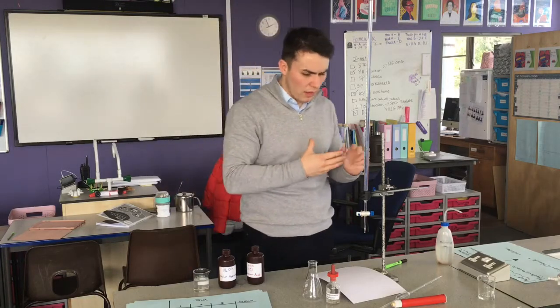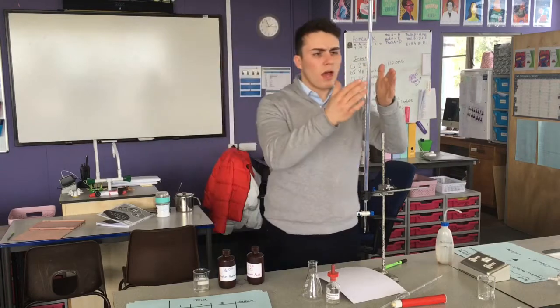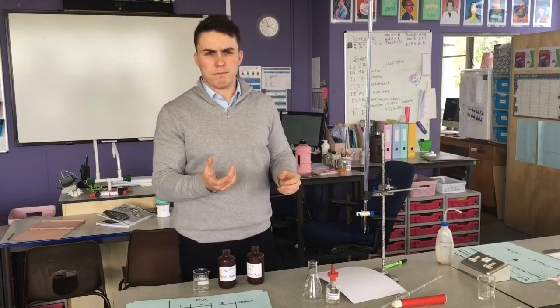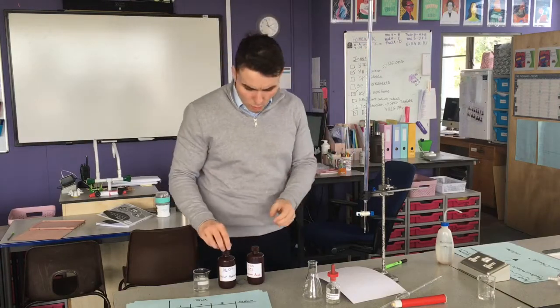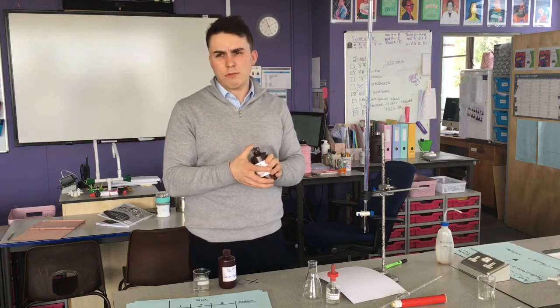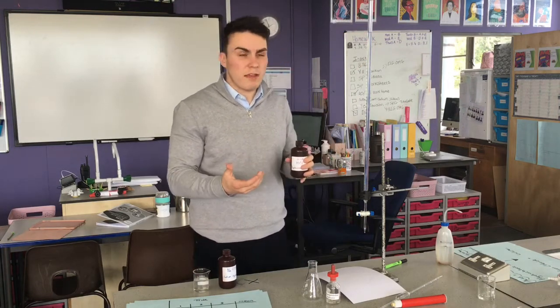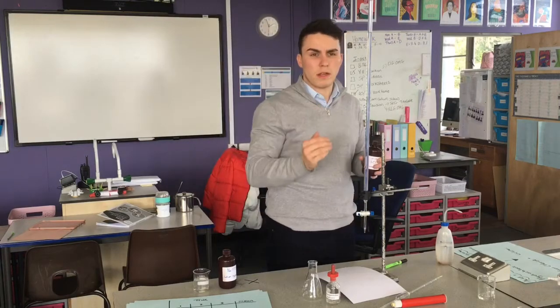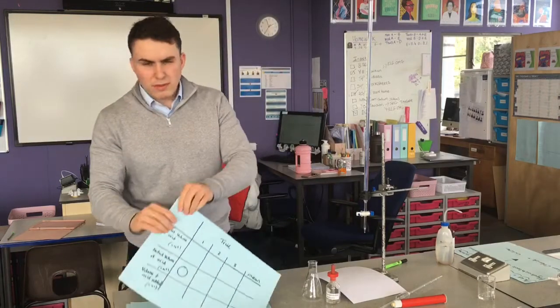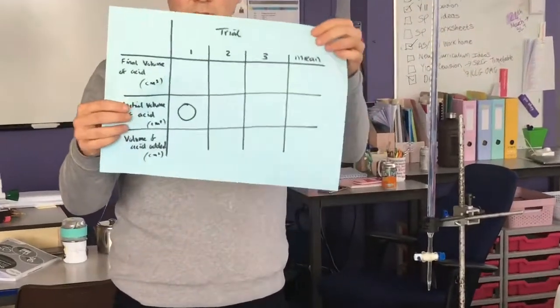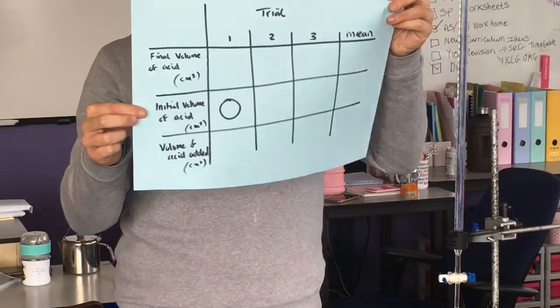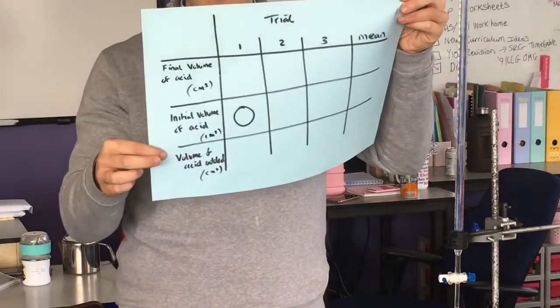Let me quickly run through the equipment. I've got a burette here that runs from 0 to 50, and I've filled that with my hydrochloric acid and put it at the 0 mark. I could start elsewhere, but just to save my maths I always start at 0. In my table of results, for my initial volume of acid I have put 0. We're going to look for the final volume of acid and the volume needed.